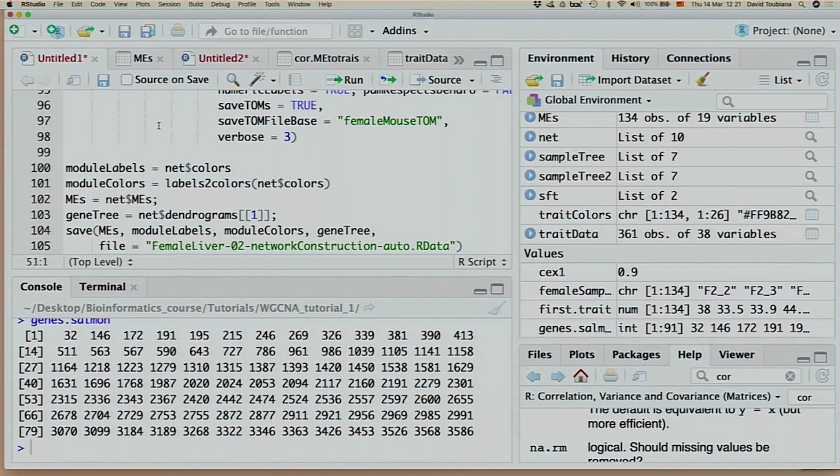So the next step, which many people do, but I don't believe in it at all and I wouldn't recommend you do it, but I still have to mention it, is gene ontology term analysis, GO. That's why we installed the package GO.db. Has anyone heard of gene ontology term analysis? Can anyone explain it?